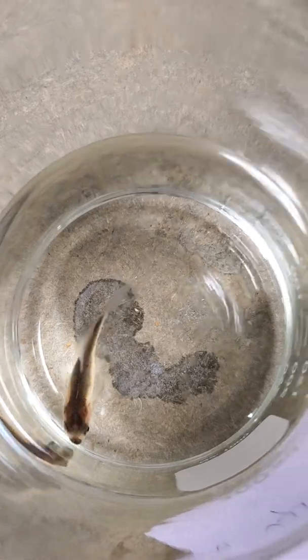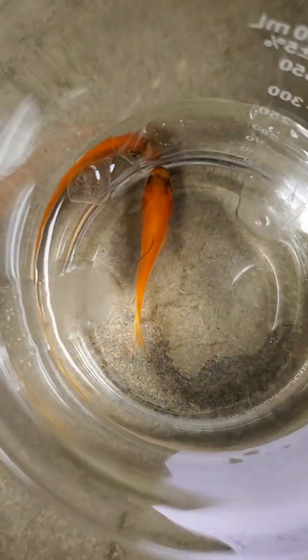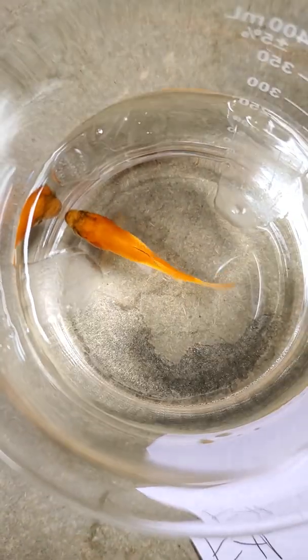And time. We're going to come to our experimental goldfish. It is 11.1 degrees Celsius. And start.